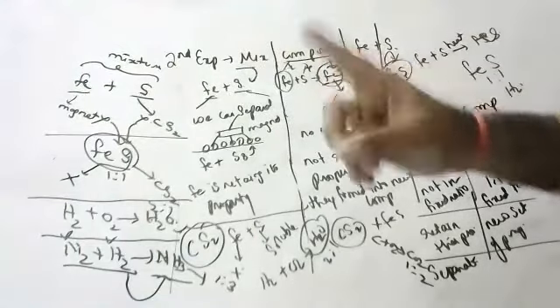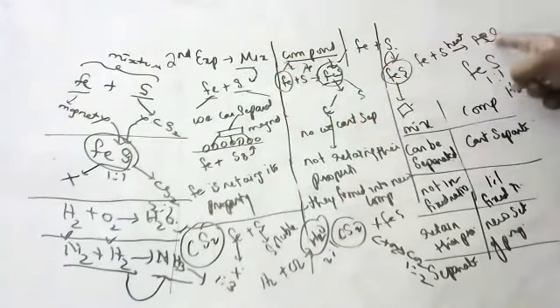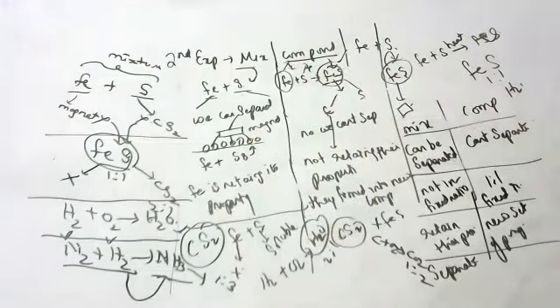Iron and sulfur individually are called a mixture. When they form iron sulfide, it is called a compound. It lost its magnetism property, it lost its dissolving property in carbon disulfide. It gets a new set of properties. So I hope you are able to understand. Anyone have any doubt in this?